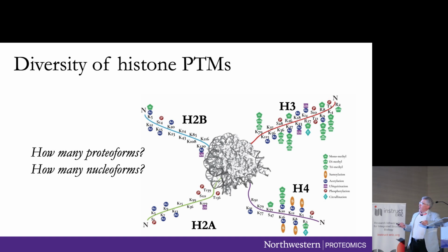So yeah, let's apply then what I've mentioned to you. Proteoforms, how many of them are there on these different histones? This has been largely mapped out now. And for histone H4, for example, where are we? Here we are. Histone H4 has lots of different modification sites. Minimally, you could say, well, how many proteoforms are there, right? So I have all these different sites known.